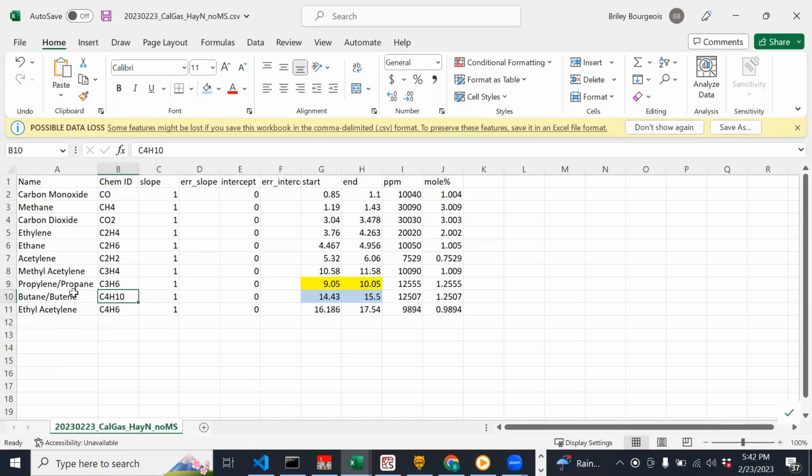So right now, if you try to do a hydrogen balance with both of these, for example, you would have problems. But for carbon balances, this should be fine. You just have to know that what gets calculated as propane or propylene is really the combination of the 2. And that's pretty much the best way to handle this if you have overlapping gases from your GC. Ideally, you would have a hardware setup that would be able to resolve all the different molecules, but if you don't, this is one way that you can set up your calibration gas so that you don't have any problems.